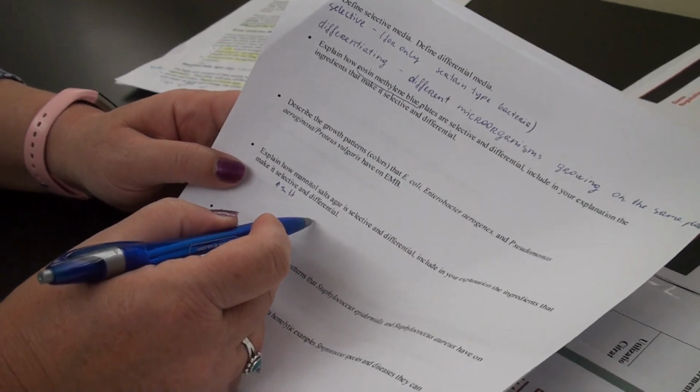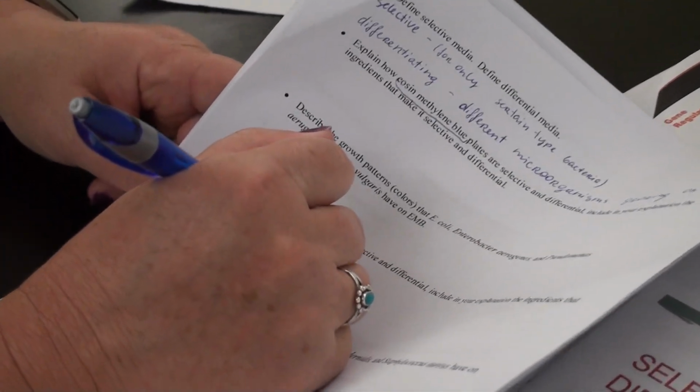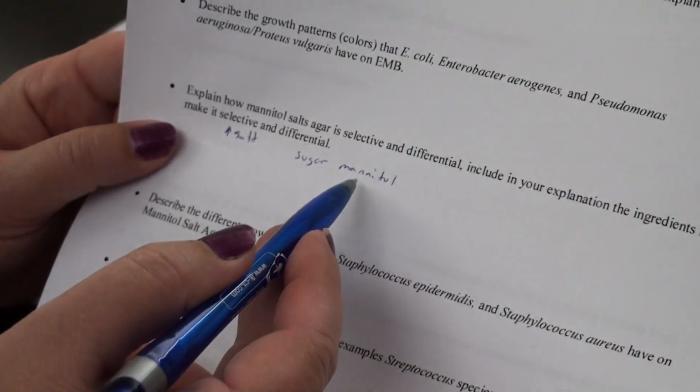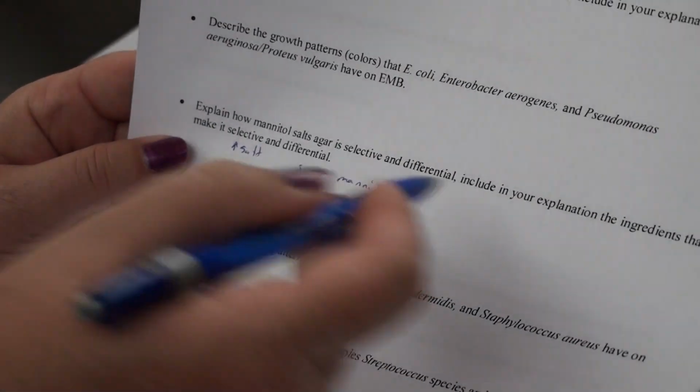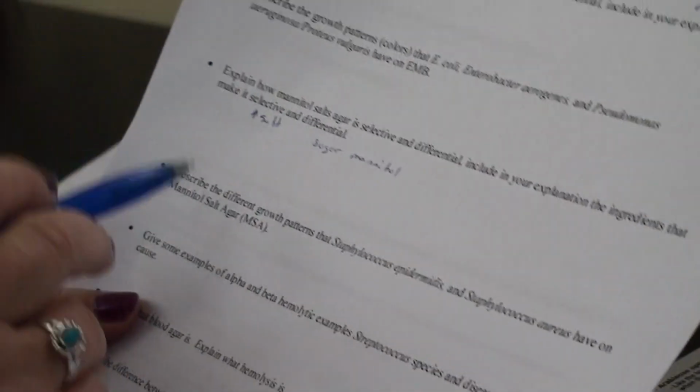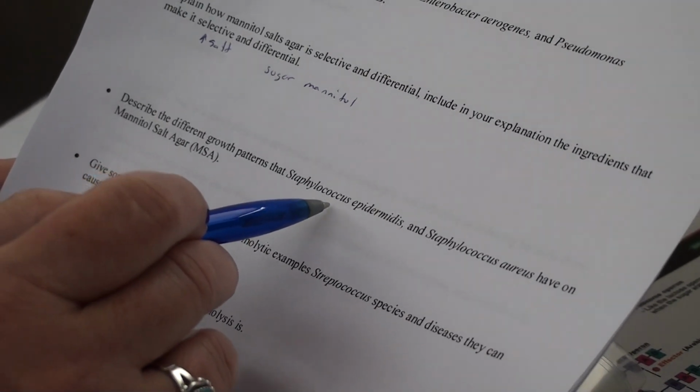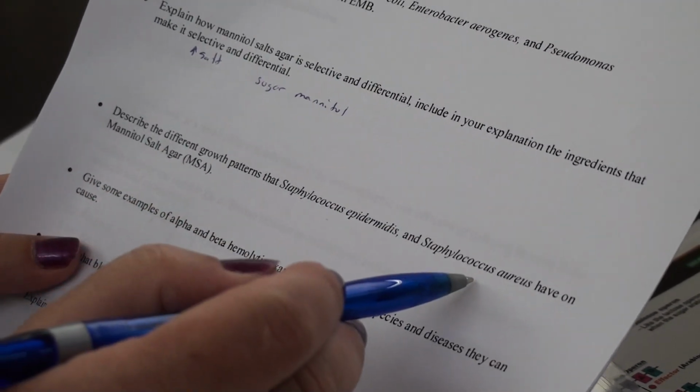The ingredient that makes it differential will be the sugar mannitol, whether it ferments it or not. Okay, so that's what he wants for the answers for that. Next, it says describe the different growth patterns that Staph epi will show versus Staph aureus.